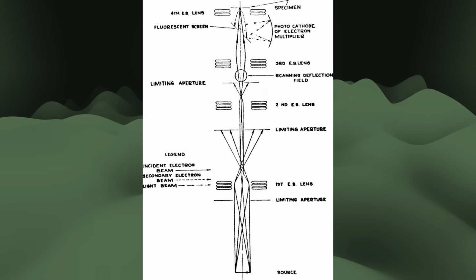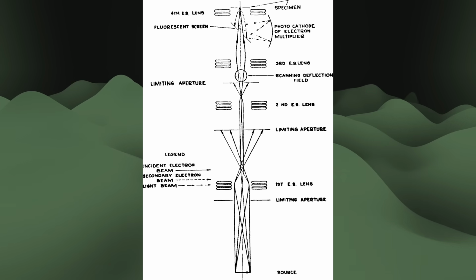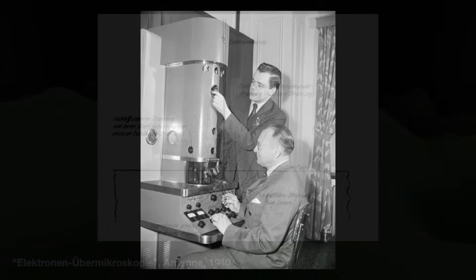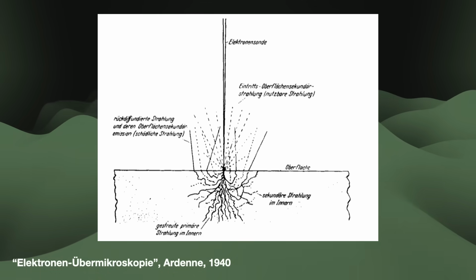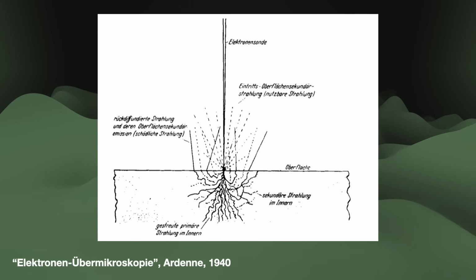The previous body of work done at RCA had shown that its scientific principles were fundamentally sound. There also seemed a pathway towards solving the RCA SEM's long recording time and noise issues. The two problems were related. The longer it took to record the image, the more noise there was. Oatley reasoned that if they can somehow collect more of the electrons coming back from the sample, then you can both cut the recording time and improve the noise. You might even be able to put the imaged result on a cathode ray tube screen for more convenience.